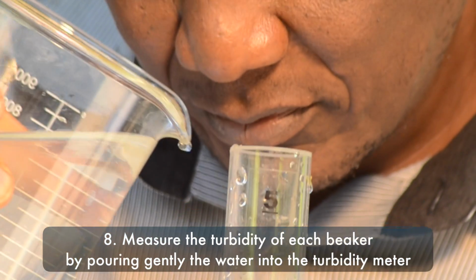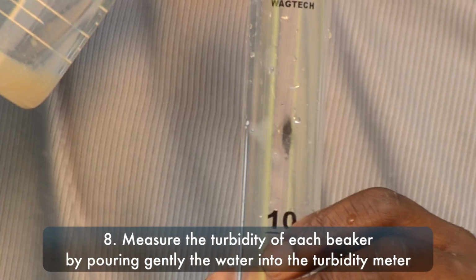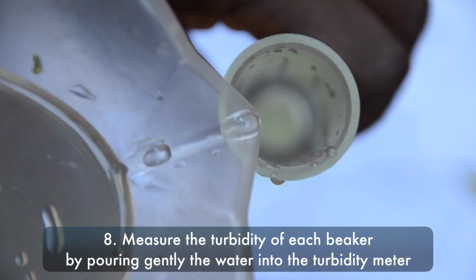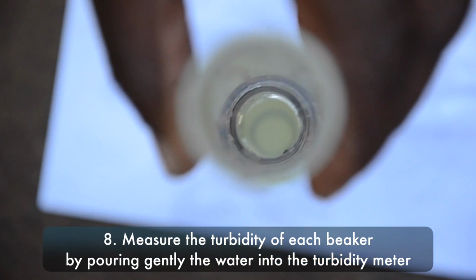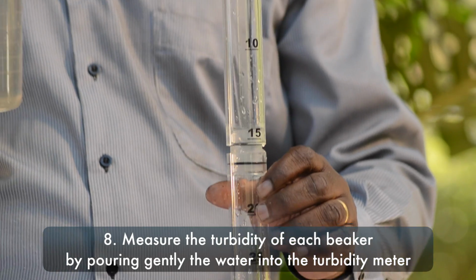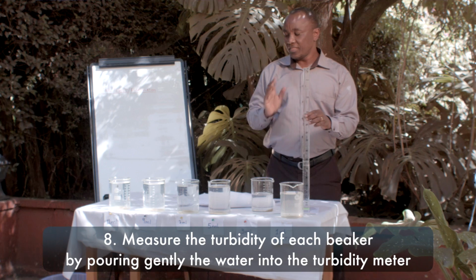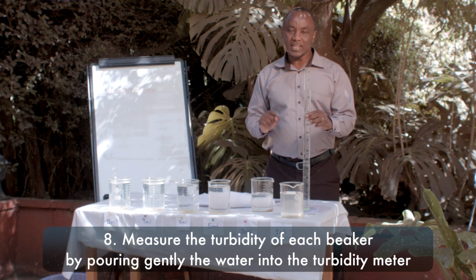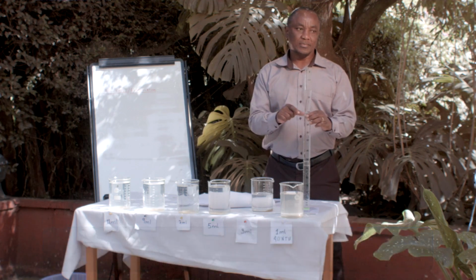Remember to hold the beaker gently so that you don't disturb the settled sediments. The cross has just disappeared and the turbidity of water is still 40. That means nothing much has changed for the first beaker. Then we will repeat the process in all the remaining beakers, determining the turbidity for all the 6 beakers.